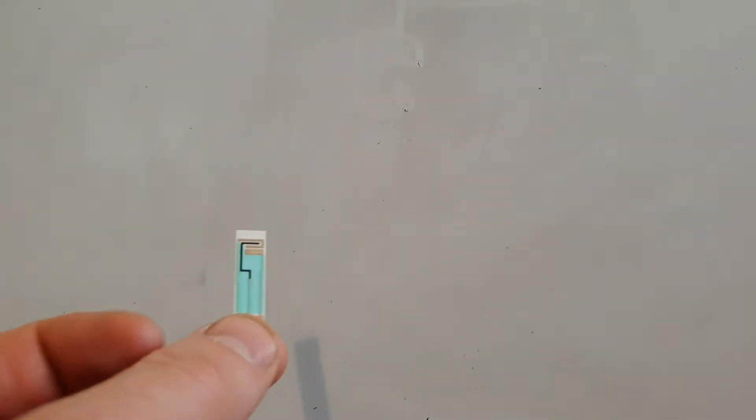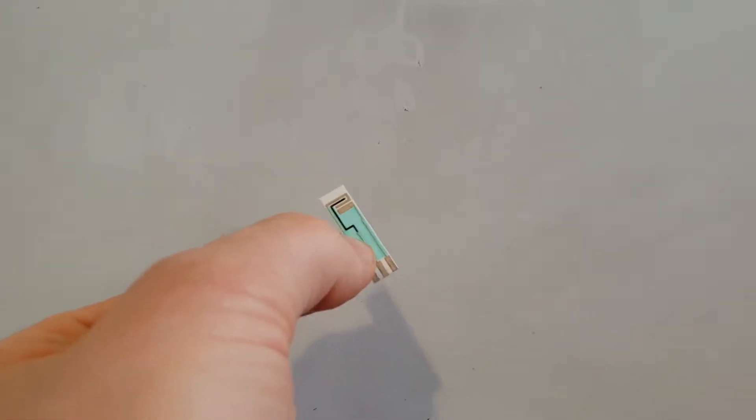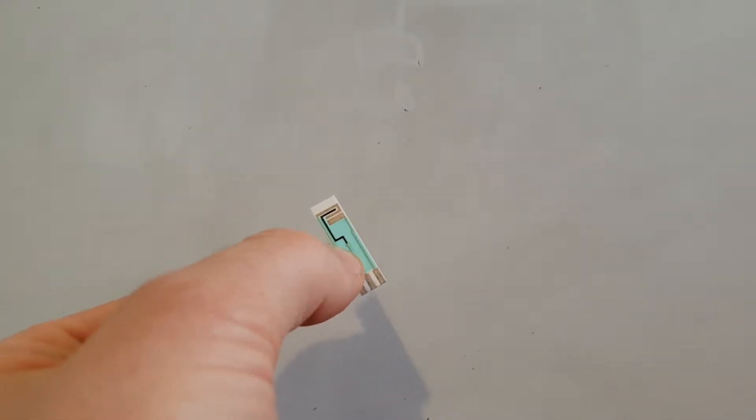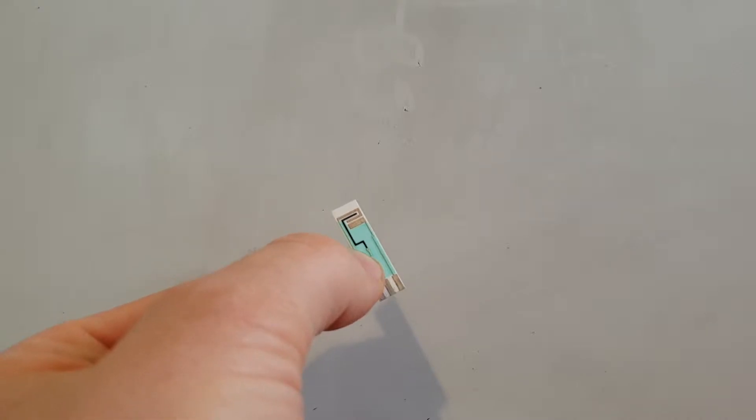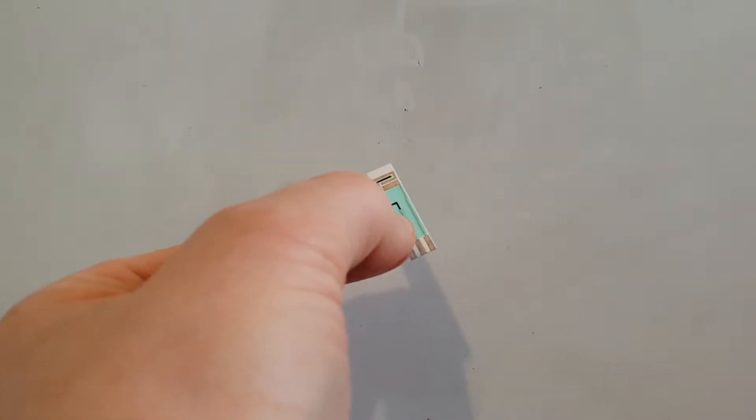Hi, this is just a quick video from Zimmer and Peacock about reference electrodes. If you're into sensors, biosensors, medical diagnostics that are electrochemical in nature — or working with screen printed electrodes — they'll often have a silver/silver chloride reference electrode.